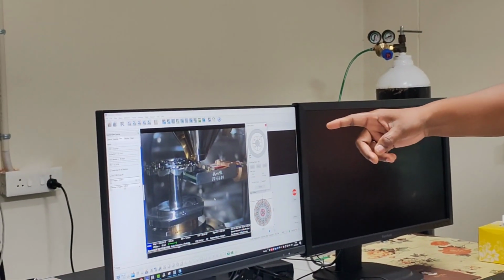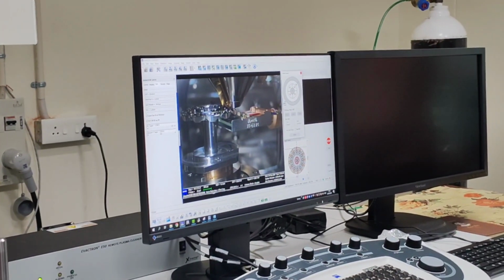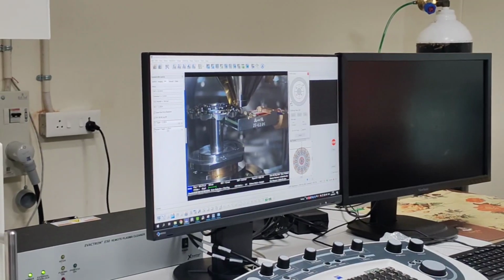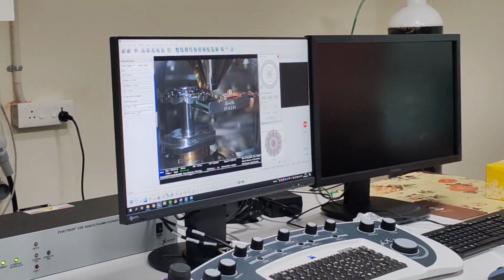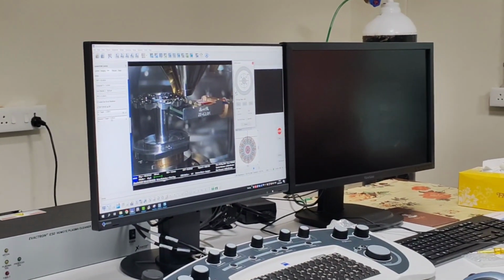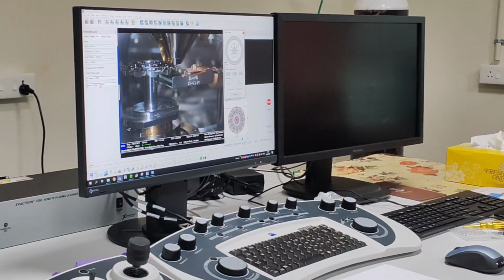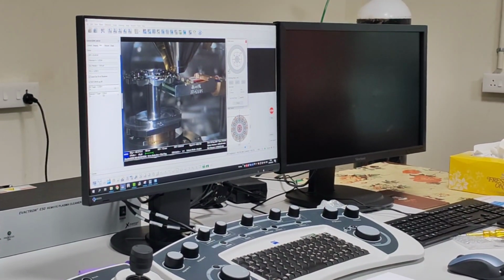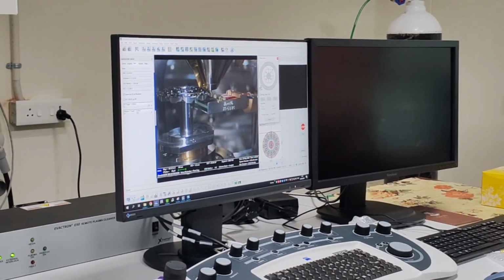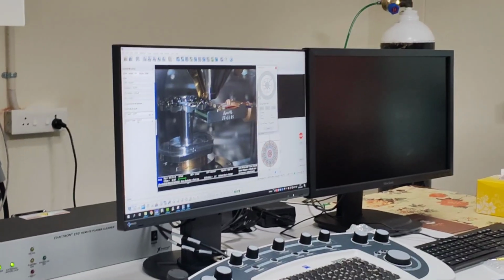We even designed a detector in such a way that you are able to do tomography once you have the surface information. If you tilt plus or minus 70 degrees, normally in a TEM holder, the holder will go plus or minus 70 degrees, and at all those angles the system will collect the slice information. Later, through the algorithm, it will stitch and give you the complete 3D tomography. What it means is the complete 3D volume information, how exactly it is inside. But the sample size is very limited, 3 mm.